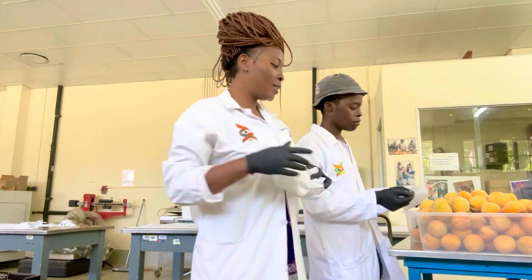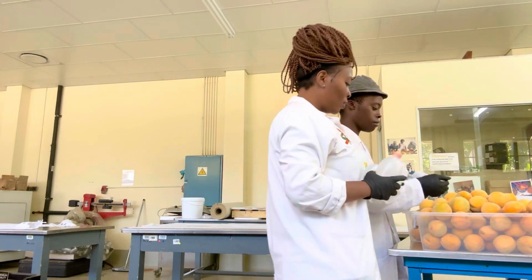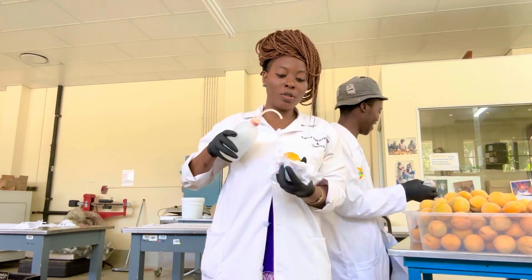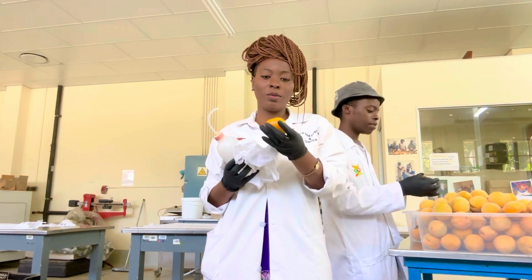So guys, now we're gonna sanitize them. And this is alcohol. And it's sanitizing. The goal is to remove all the microbes that you bring.